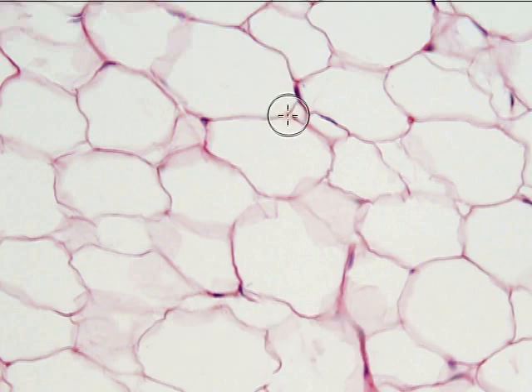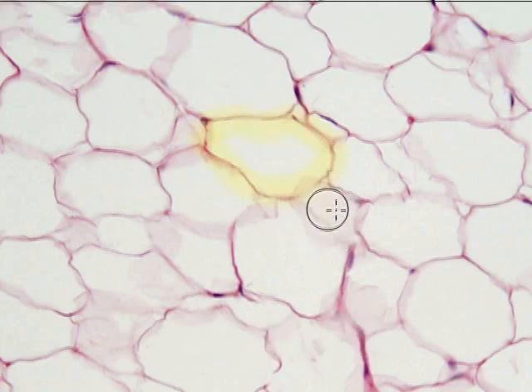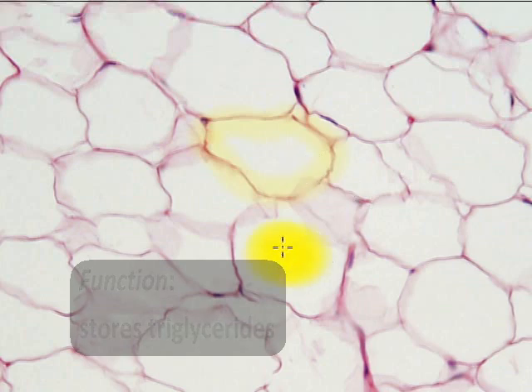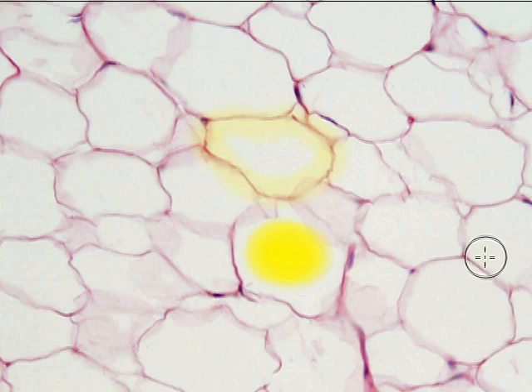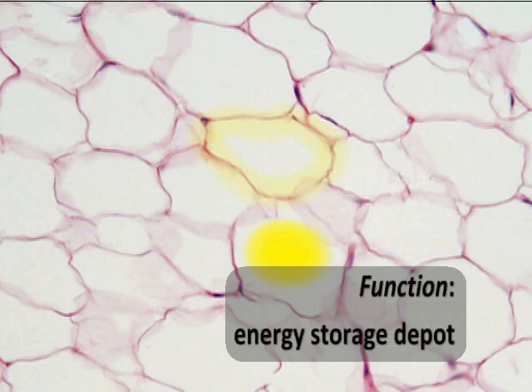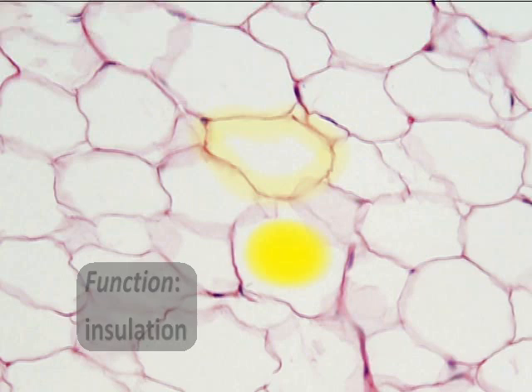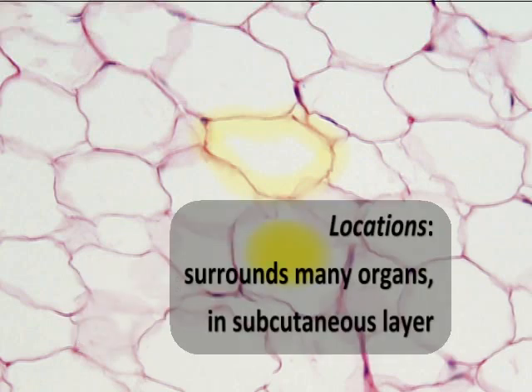Our next loose connective tissue is adipose tissue, made up of these bubble-like adipocytes — the fat cells — which store triglyceride fat within their interior. They can swell to large sizes to accommodate increasing amounts of lipid, and they act as a major energy storage depot that can build up fat supplies but also release them to the body as needed.